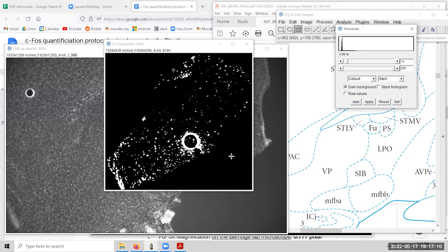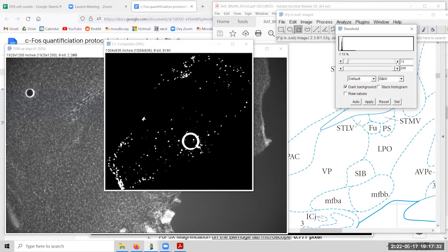There are some advantages to selecting either of these. In this case, it looks like more stuff is popping out. But the downside is that if any of these blobs are too close together, if they're basically touching each other, then they look to the program like one larger blob. And as a result, it may not count it because it's beyond the limit of how big it should be that we set. If we tweak it up another step, we'll definitely shrink down the blobs so that things are smaller and separated. But additionally, it'll get a little bit more tricky where we've lost some information, we've lost some data.